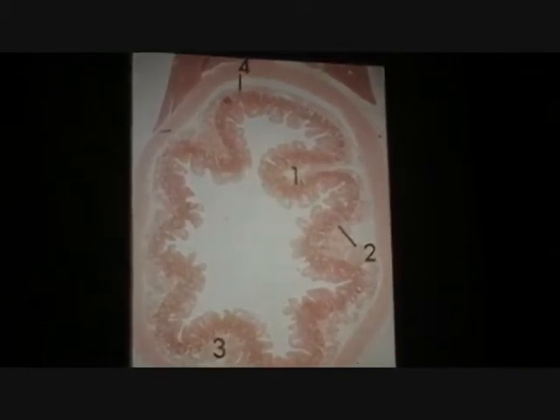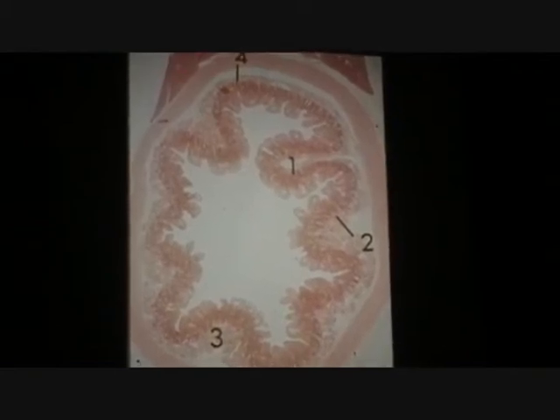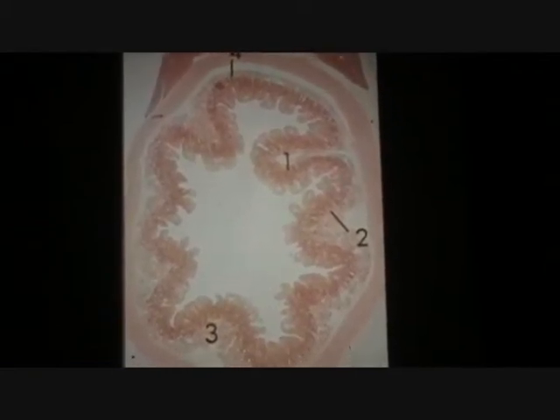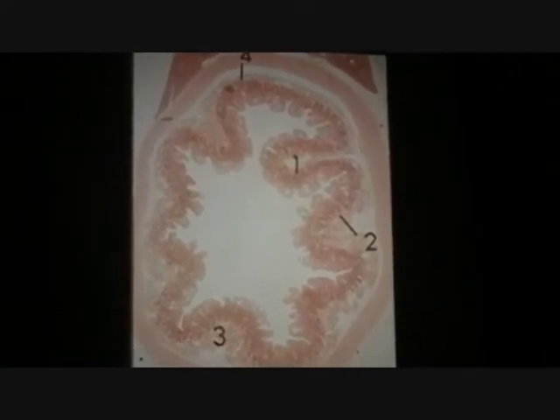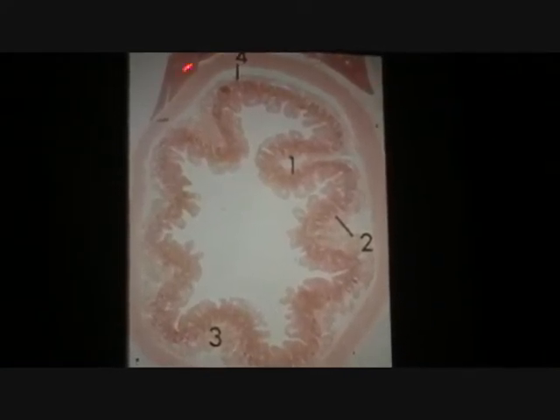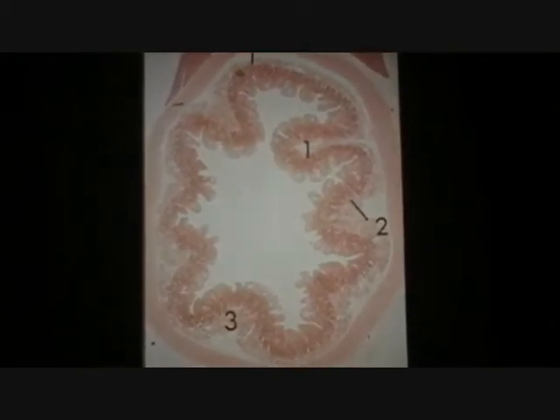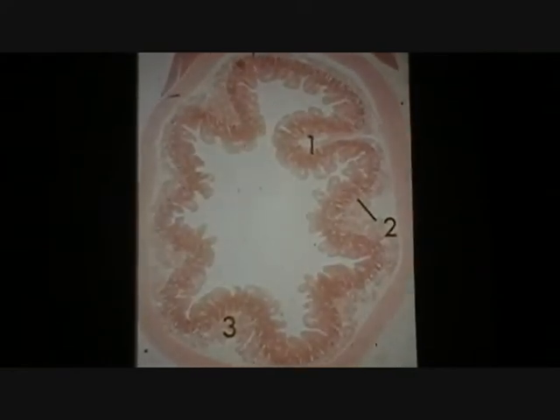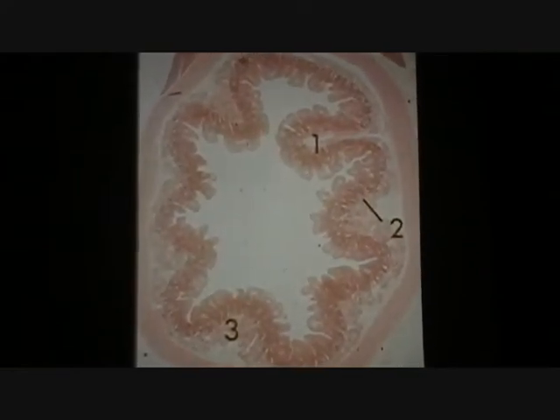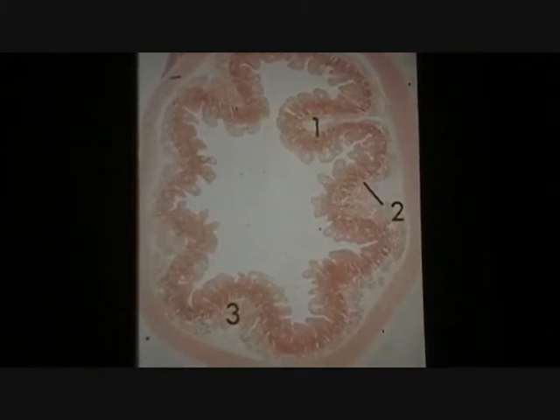What's tucked into it? This is pancreas. Remember, pancreas tucked right into the inside curvature. Just caught the edge of the pancreas. But you will never need to know that for this presentation. So you're a histogenius. You could make that association without someone telling you.